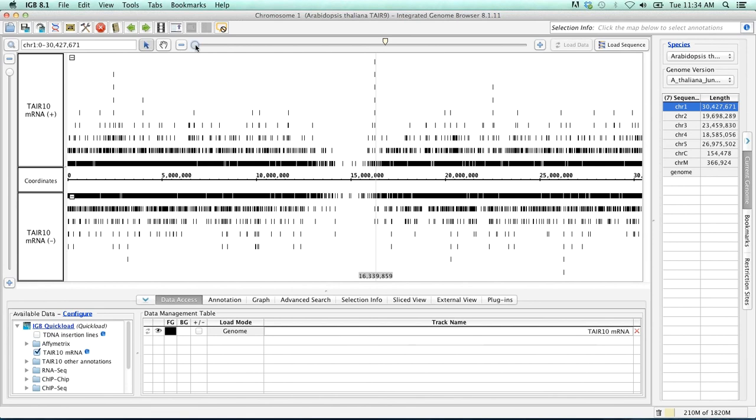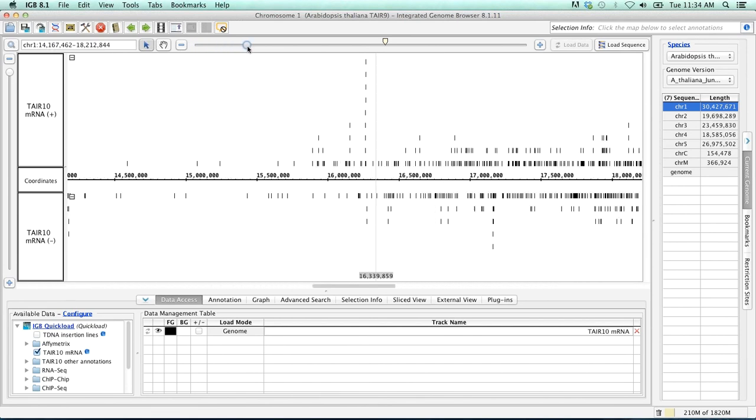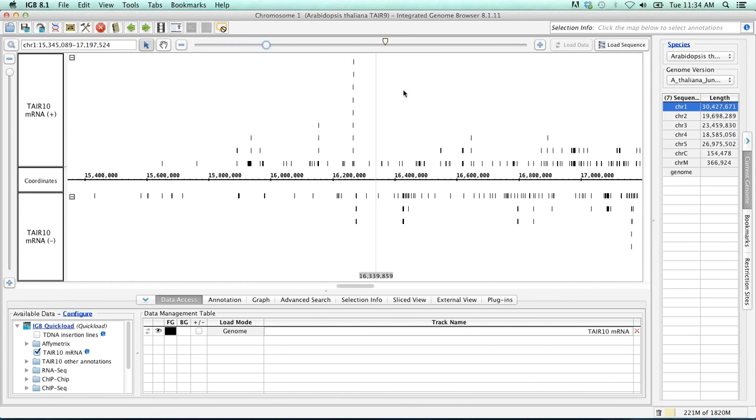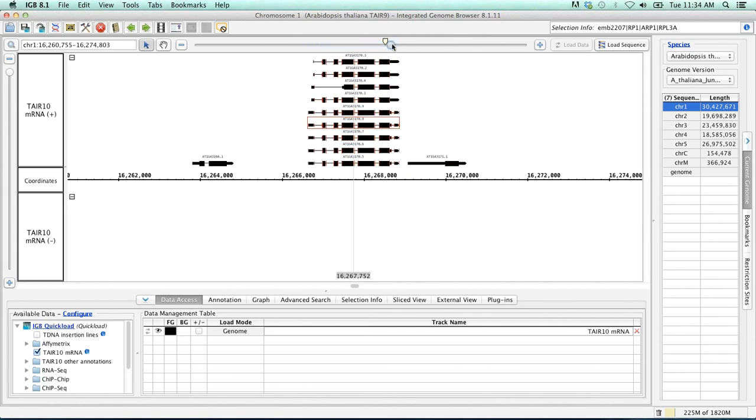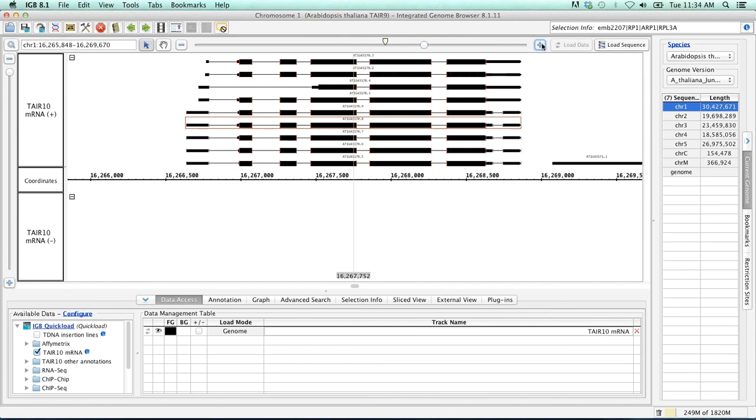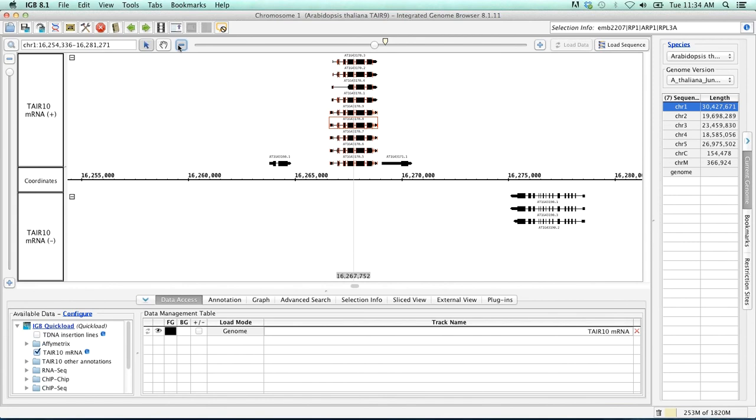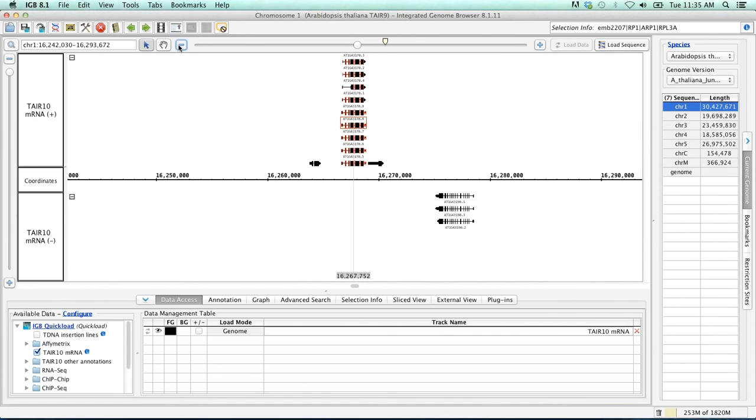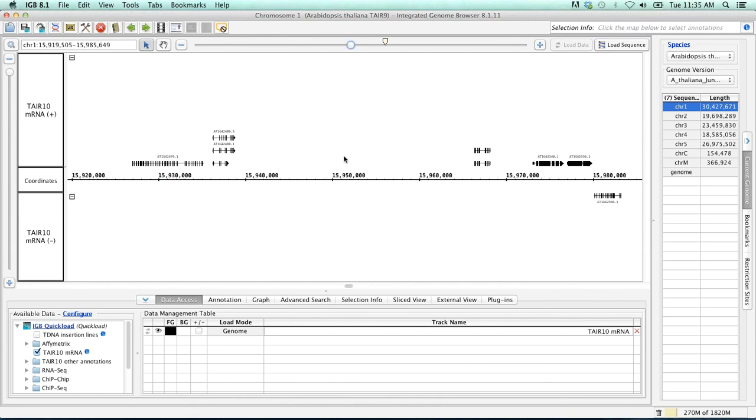You can either use the zoom slider here to zoom in, and this is going to zoom in on this zoom stripe that I've positioned here. Similarly, we can just use the plus or minus buttons to zoom in on this region. In addition, if there's a region you're interested in, you can simply drag along the coordinates axis to highlight this region and zoom in. Or if a particular gene model is interesting, you can simply double click on it to zoom in on that gene model.